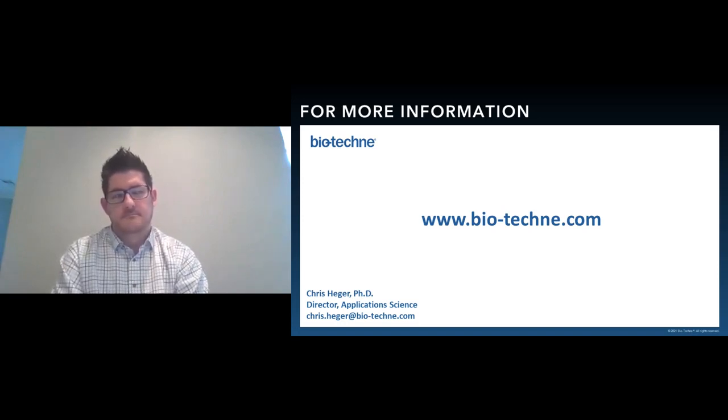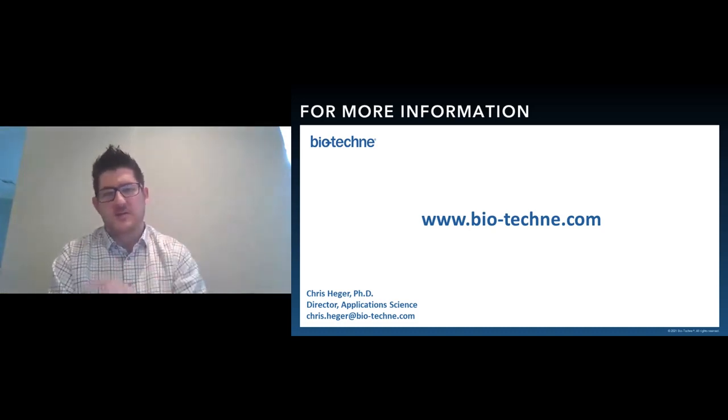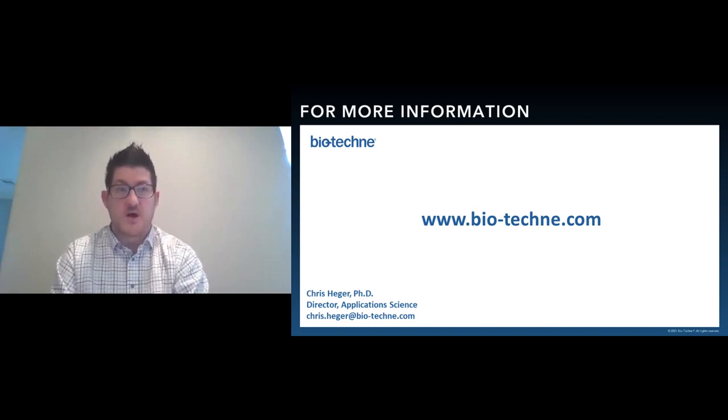Okay, and the theoretical capsid ratio is 10 to 1 to 1 for VP proteins. From your data, can you comment on the measured ratio of 7 to 1 to 1? Sure. So yeah, 10 to 1 to 1, VP3 to 2 to 1, is the theoretical ratio of the 60-mer capsid. However, it varies between serotypes as well as even preps of the same serotype.